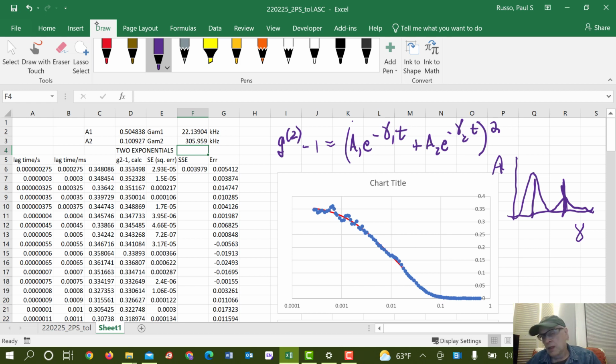Interesting, huh? So when you try these more generalized Laplace inversion methods that are discussed in Chapter 12, the light scattering tutorial review, what you'll see is that they have ways to give you something that looks like a continuous distribution, but right now you have no real excuse for using them because you can fit it perfectly well with 2 exponentials. So those distributions are a way of drawing what it thinks is the best possible answer.